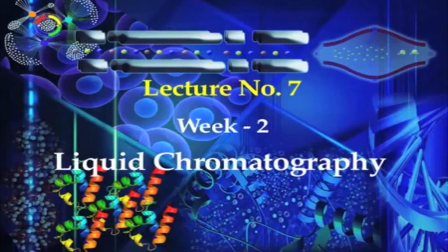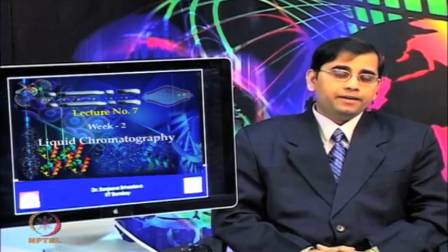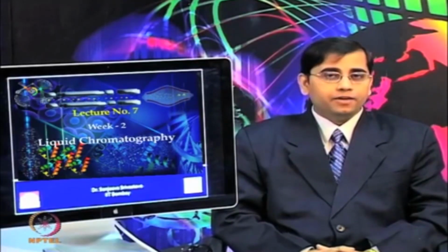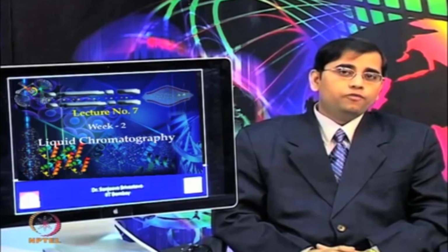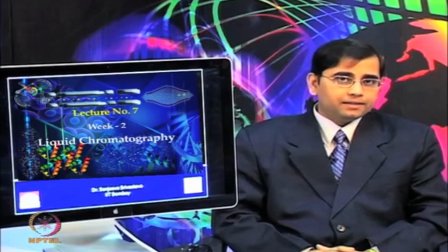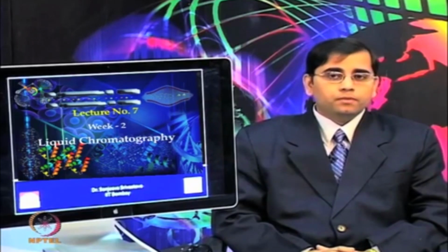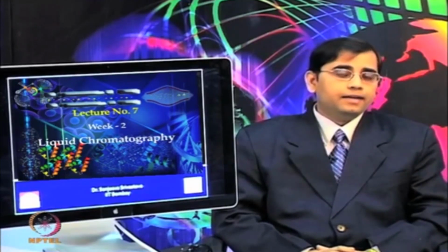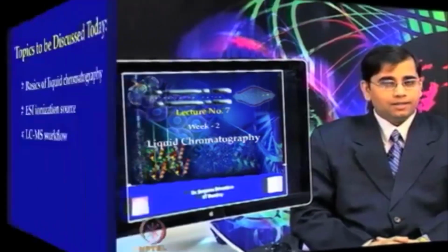Today we will talk about liquid chromatography, mass spectrometry or LC-MS. MS is based on production of ions which are subsequently separated according to their m/z ratio. The resulting mass spectrum provides a plot of relative abundance of generated ions as a function of m/z. MS provides the most versatile platform and comprehensive analytical technique for the proteomics scientist for a wide variety of applications.